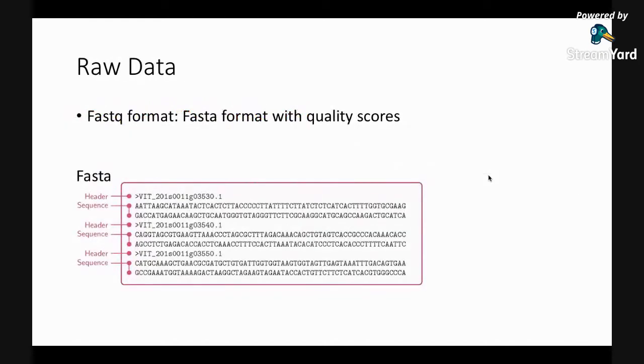You will not be the one demultiplexing the data that comes out of the machine. That is the responsibility of the person who is doing the sequencing for you, since Illumina already provides them with that information. So you will not be separating the samples, but you will get information about your own sample.